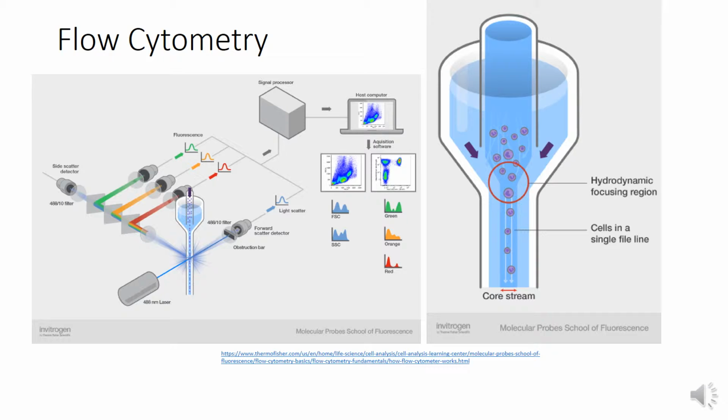So flow cytometry is a cell analysis technique that is used to measure the volume of cells in a rapidly flowing fluid stream as they pass in front of a viewing aperture. It was developed in the 1950s, and after many improvements over time, it is now capable of achieving rates of over 10,000 cells per second and over 30 detectable fluorescent parameters.